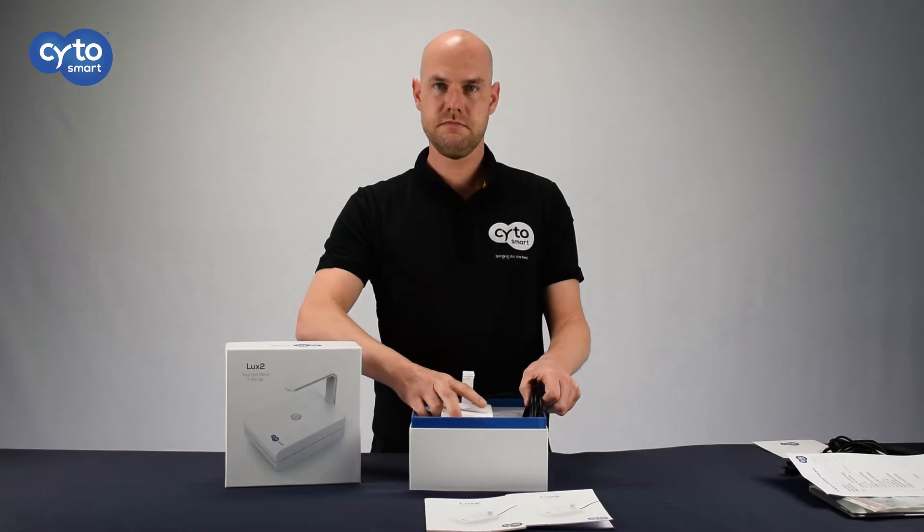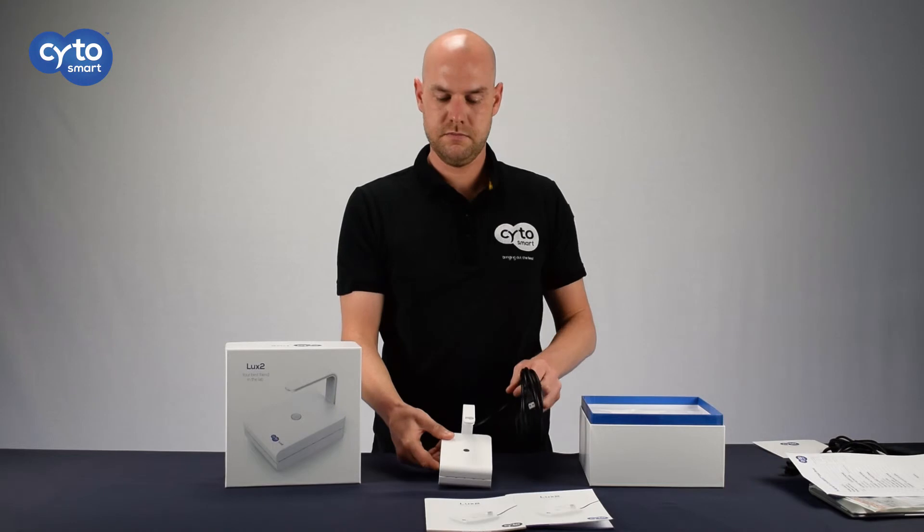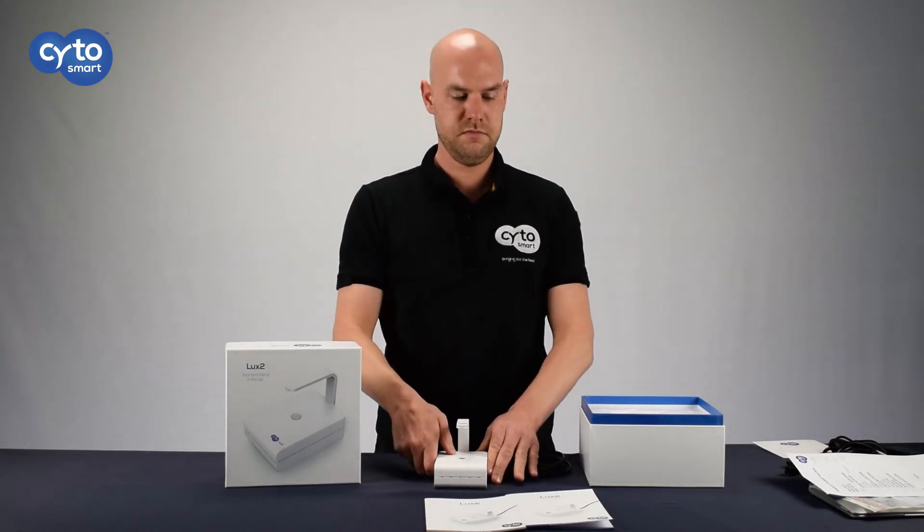The final step is to remove the LUX2 from the packaging, carefully and lovingly, and you are ready to go! Be sure to check out our YouTube channel for more tips and tricks!